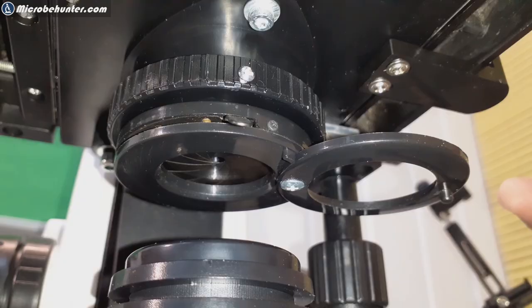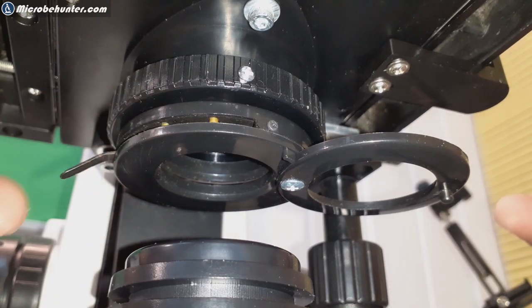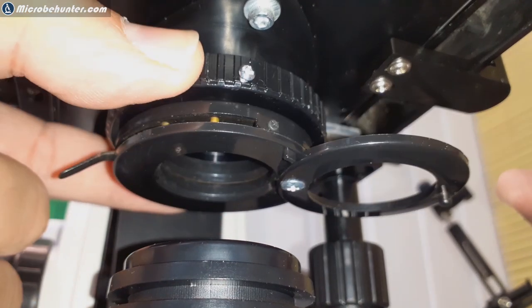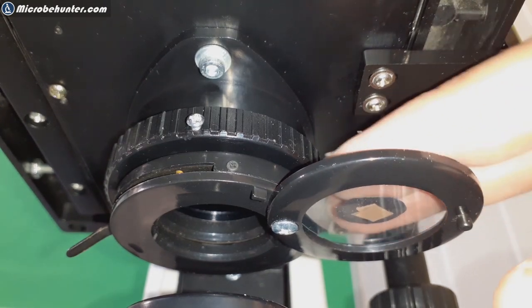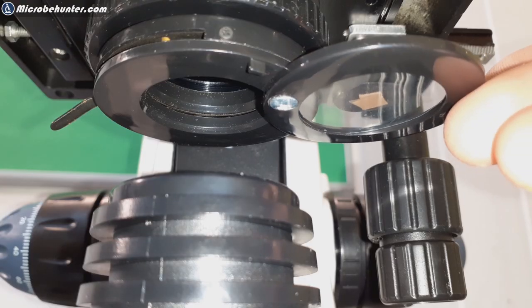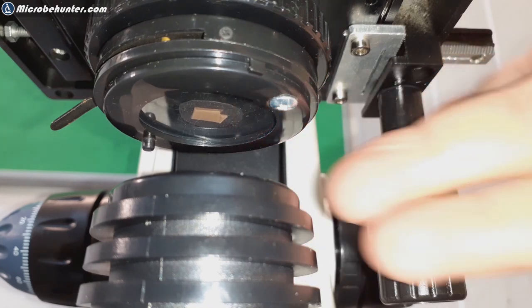I'm removing the blue filter, in case it's in there. I'm opening the condenser diaphragm all the way. I also make sure that the condenser is all the way up to the top. That's the normal position, and then I insert the patch stop filter. And then that's it. That's really it. We're ready to go. When you move the filter all the way in, you get dark field like this.